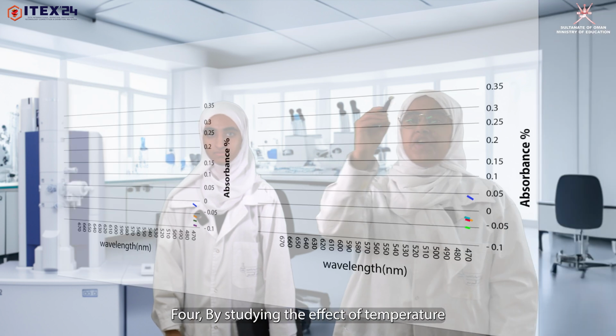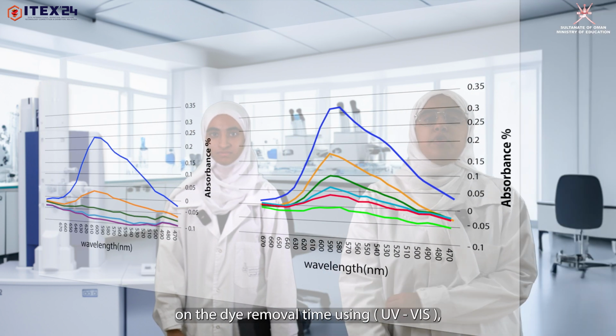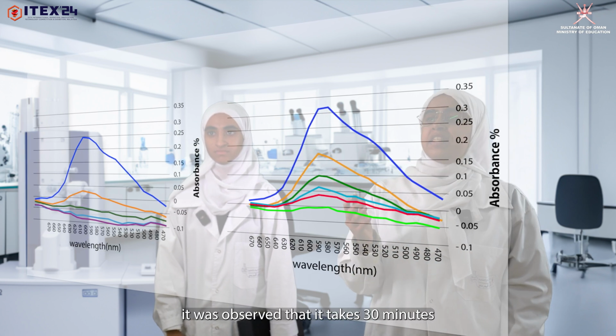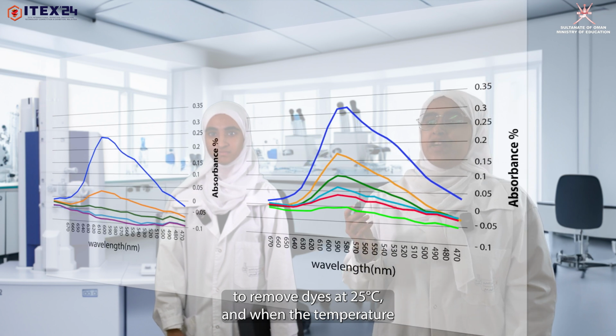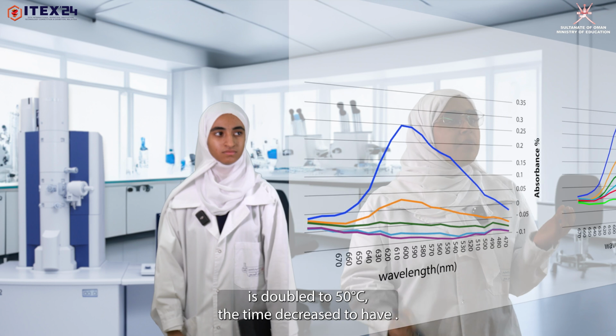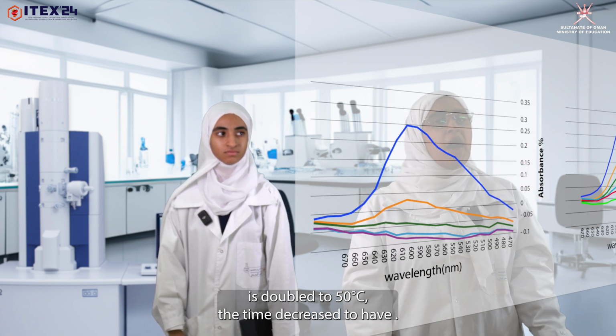4. By studying the effect of temperature on the dye removal time using UV-vis, it was observed that it takes 30 minutes to remove dyes at 25 degrees Celsius, and when the temperature is doubled to 50 degrees Celsius, the time decreased to half.